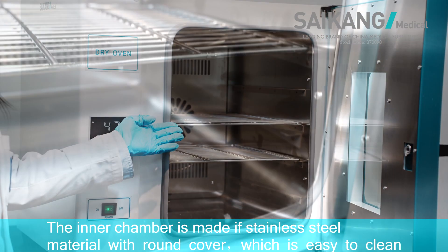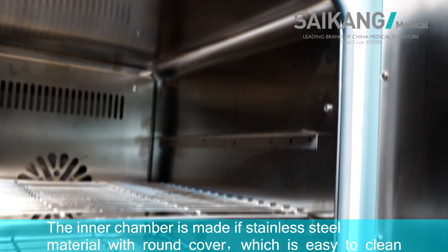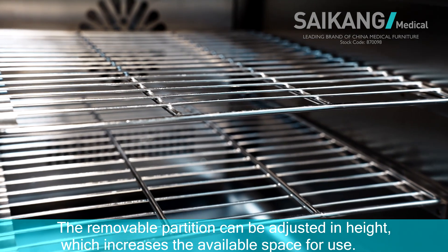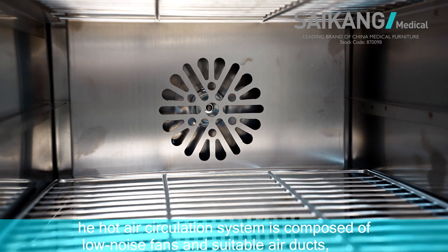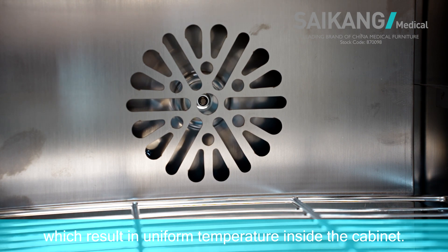The inner chamber is made of stainless steel material with round corners, which is easy to clean. The removable partition can be adjusted in height, which increases the available space for use. The hot air circulation system is composed of low-noise fans and suitable air ducts, which result in uniform temperature inside the cabinet.